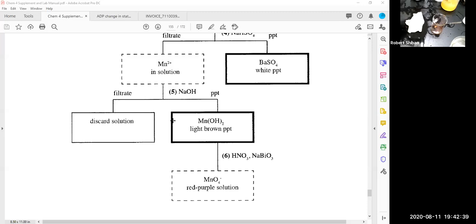So what we're looking for is a purple liquid. If you look at the bottom of this beaker, you can see there's some purple liquid there. Now, there's also some orange excess sodium bismutate. This isn't as purple as it should be because I probably have too much manganese in there. So I'll just set this in the waste. I'm going to pour this in here since I have some extra unreacted sodium bismutate, and I'm just going to mix it here.